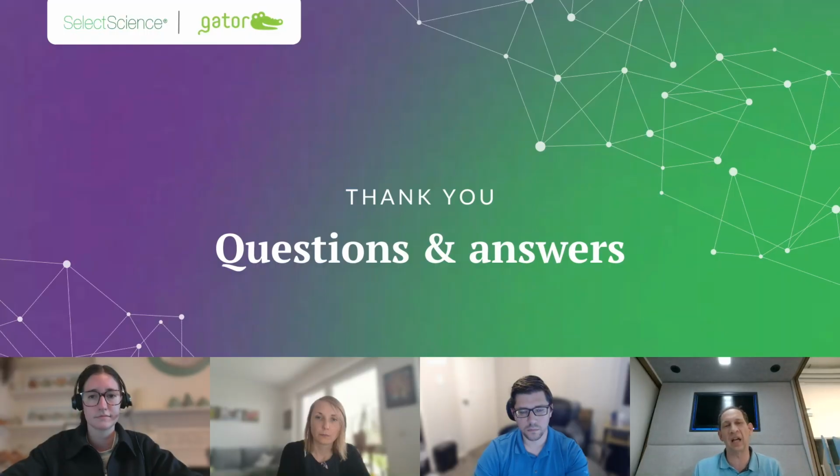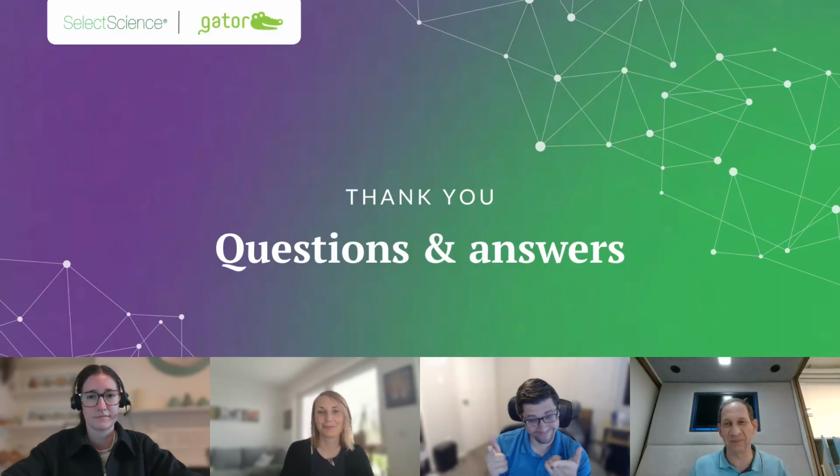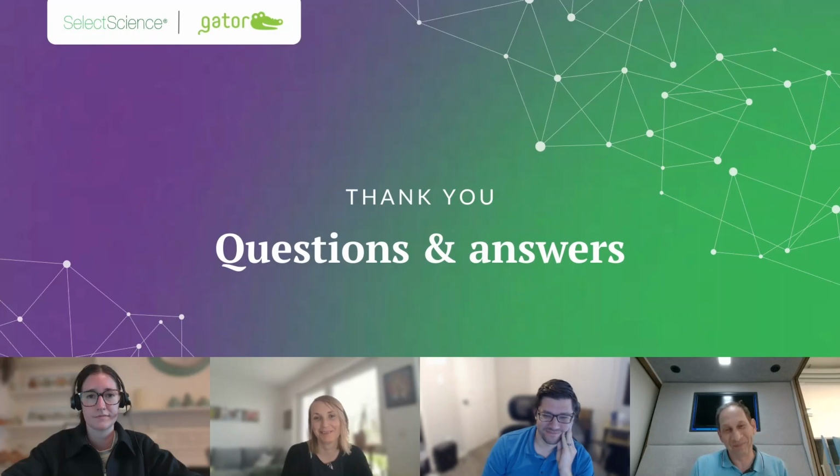And that's where we hope automation will help us. Some people think that automation will make things much faster than humans. Actually, our pipetting robot is slower than a human, but it makes much fewer mistakes and it can work all night without asking for pizza. That's my answer. Thank you.